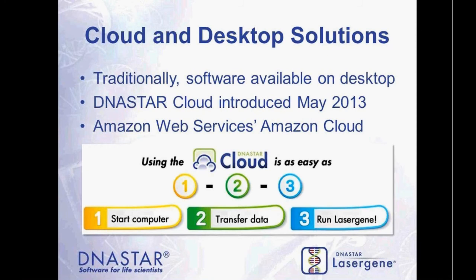Now, as I mentioned earlier, traditionally all of our software has been available on a desktop computer. We've designed our software to be able to run on the hardware available to most researchers. And I'll go over some of these hardware configurations in a second. But I did want to mention that in May of 2013, we expanded this traditional software offering up to the DNASTAR cloud. Now, this service allows you to access DNASTAR Lasergene software anywhere with an internet connection.